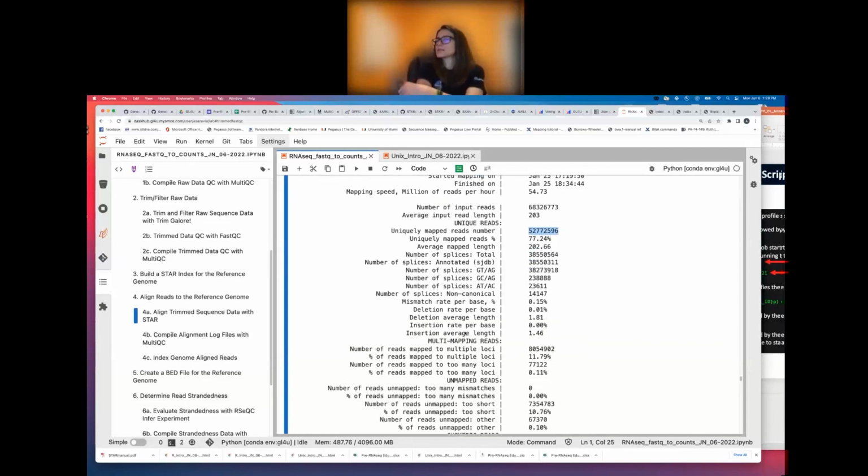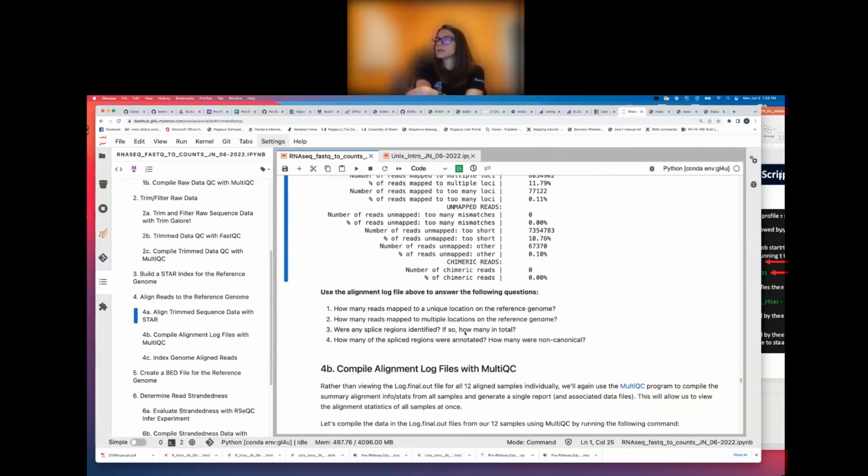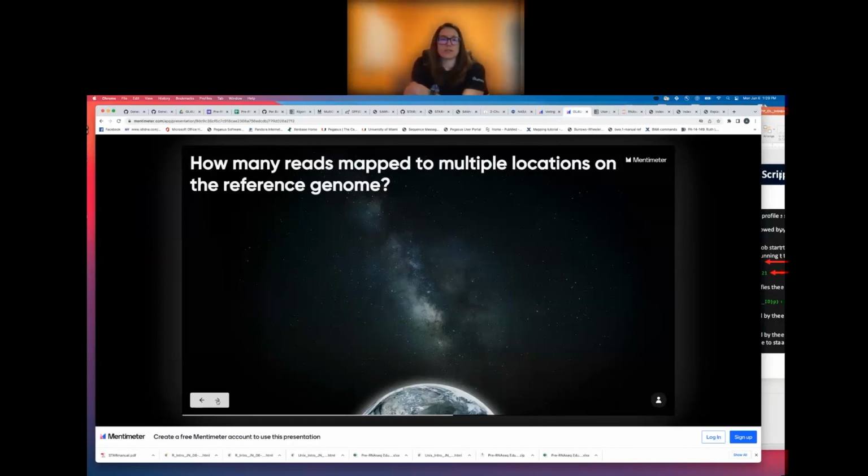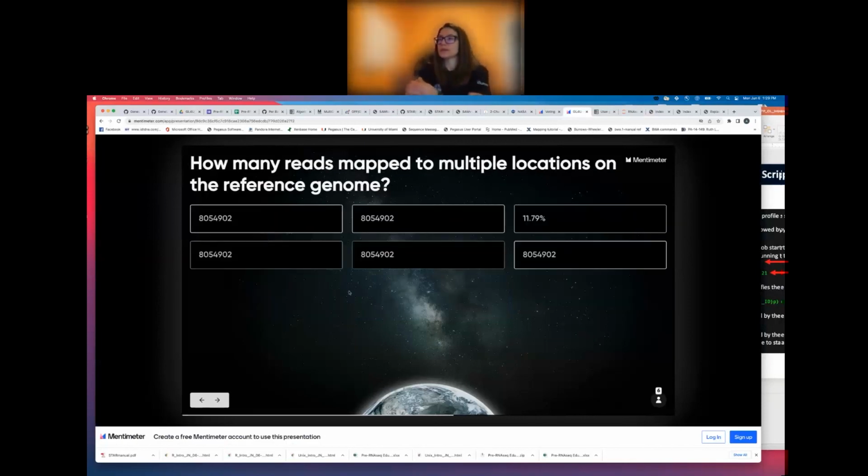Okay, I'll take silence to mean yes, perfectly clear. Okay, next question here. How many reads map to multiple locations on the reference genome? So how many multi-mapped reads do we have? So Lisa, if you could open up that question. Okay, guys, in the interest of time, I'm going to go ahead and show those results. So how many reads map to multiple locations on the reference genome? Yeah, everyone who answered answered correctly.